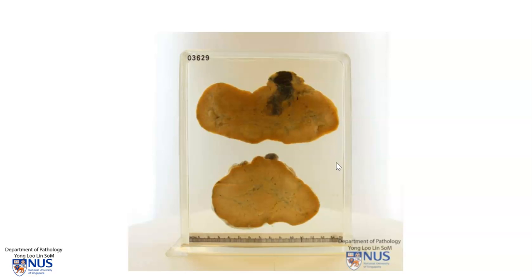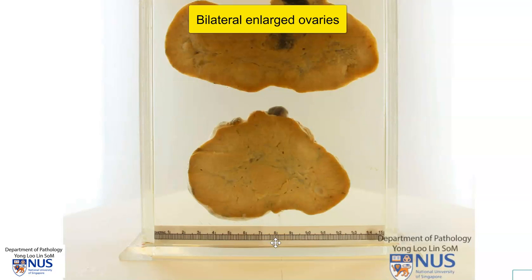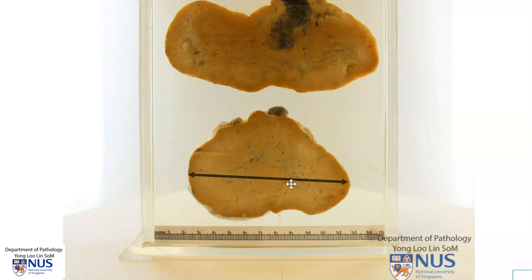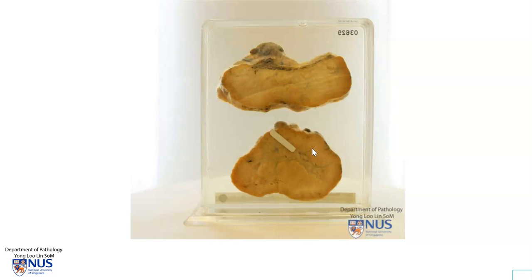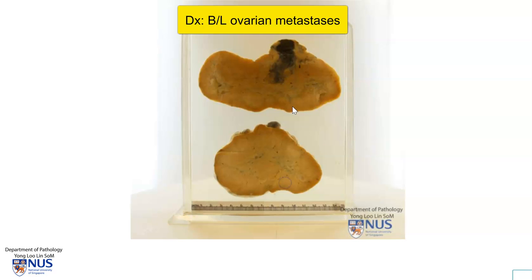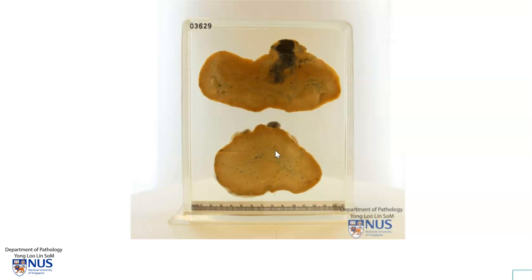Moving back to yet another case grossly — this is another specimen showing bilateral ovaries. We can see from the centimetre scale here that the ovaries are rather large; for example, measuring one, it would be approximately 7 to 8 centimetres across, which is definitely large. The ovaries also appear to be quite solid on the cut surface. This is another example of bilateral metastases to the ovaries, which could come from any of the sources mentioned earlier. If on microscopy they show signet ring cells, they would be called Krukenberg tumors, and we would really have to look very carefully in the stomach for a potential primary site.